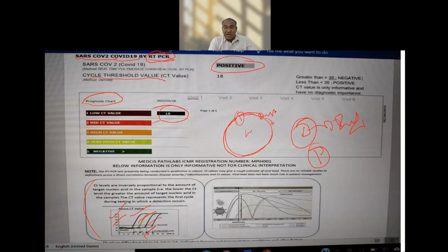Now, here you can see the coronavirus is being placed on the right side, where I'm putting my stylus. The red color which has been shown here. Once again, the dye here, where it is normal, there will be one baseline. We call it the movement above the baseline, or decrease below the baseline. Once again, a big story that is not required for you, but the basic points I am going to teach you here. So keep in mind that we are not going to make any mistake when identifying or reading these PCR values, which we call CT values, for one particular patient who is suffering from COVID-19.